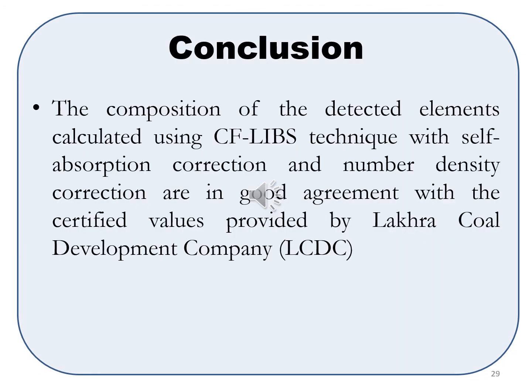Now we have concluded that the composition of the detected elements calculated by using the calibration-free LIBS technique with self-absorption correction and number density correction are in good agreement with the certified values provided by the Lakhra Coal Development Company. So it actually increased the efficiency of the method.